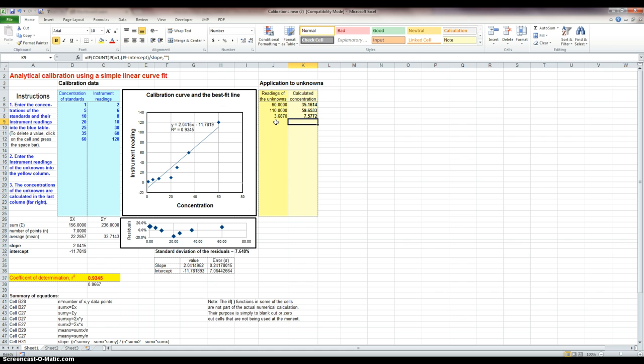If there's something in there, it equals 1. So then it satisfies this Boolean argument. If so, then you apply this formula. Okay? So these are just ways to see what some of the things you can do with Excel to make it a very flexible and useful and time-saving instrument.